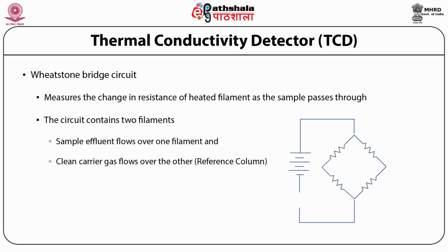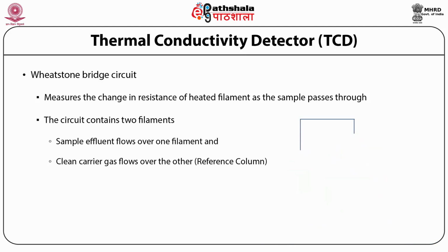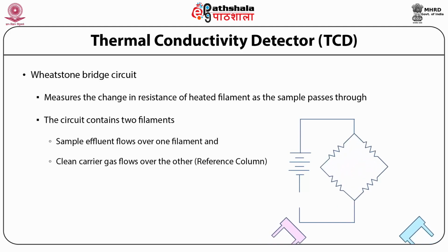As compared to other gas chromatography detectors, thermal conductivity detectors are more sensitive to temperature variation. Thus, the function of the reference side of the thermal conductivity detector nowadays is to minimize the drift due to temperature and flow change in the cell during the run. Let us study the principle on which the thermal conductivity detector works.